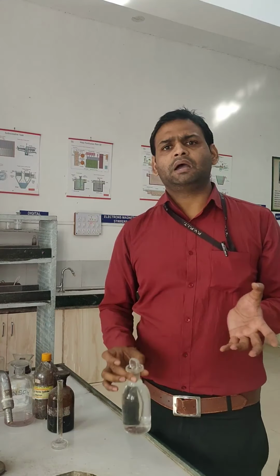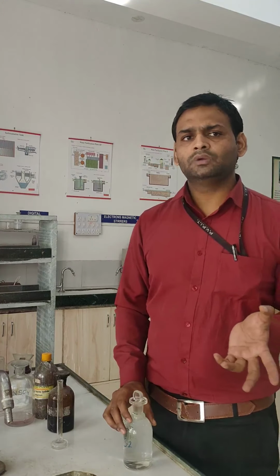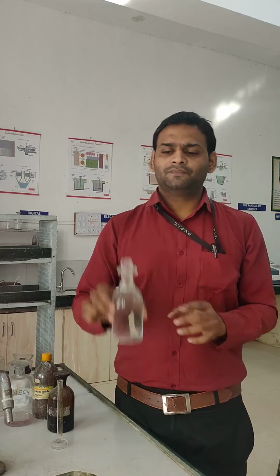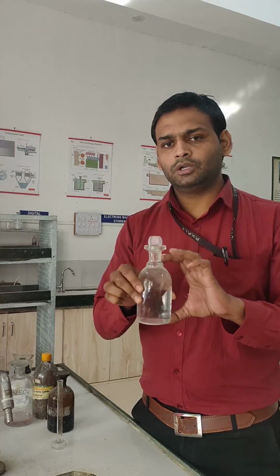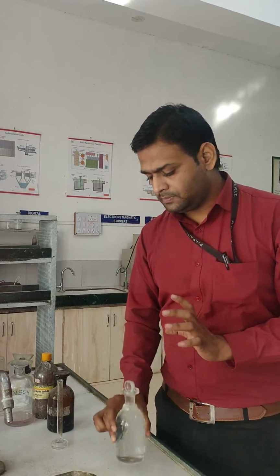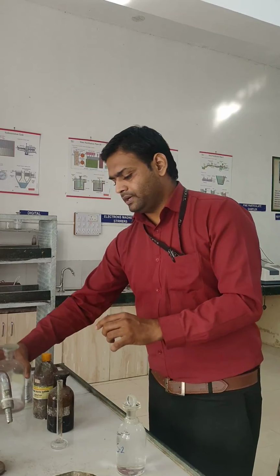You should collect the sample by the grab sampling or composite sampling method. By any method you can take the wastewater sample. Just fill this wastewater in this BOD bottle. Then add 2 ml of manganese sulfate.